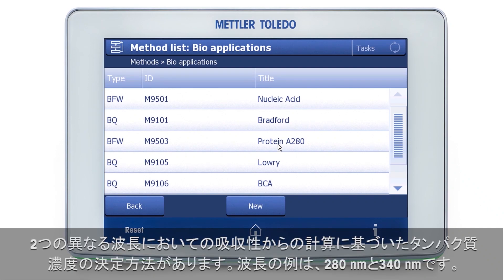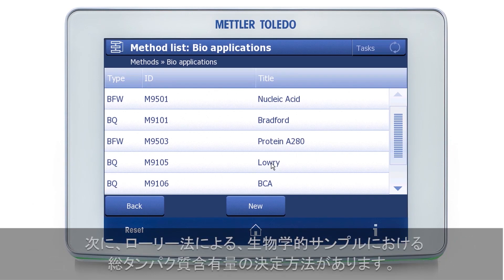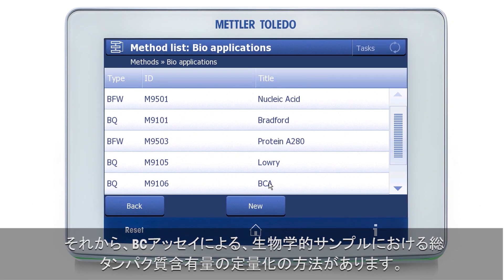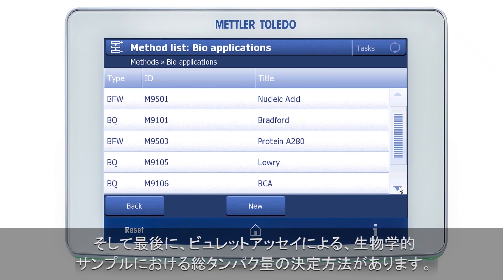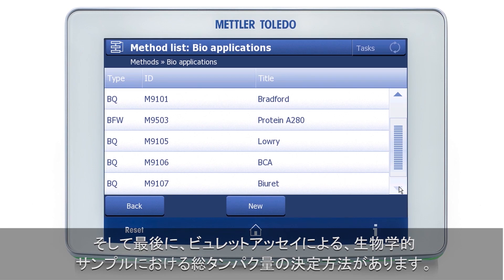Then we have a method to perform protein concentration determinations by calculation from the absorbencies at two different wavelengths, for example 280 and 340 nanometers. Then we have a method to determine the total protein content in biological samples according to Lowry. Then we have a method for the quantification of the total protein concentration in biological samples with the BCA. And finally, we have a method to determine the total protein in biological samples with the Biuret assay.